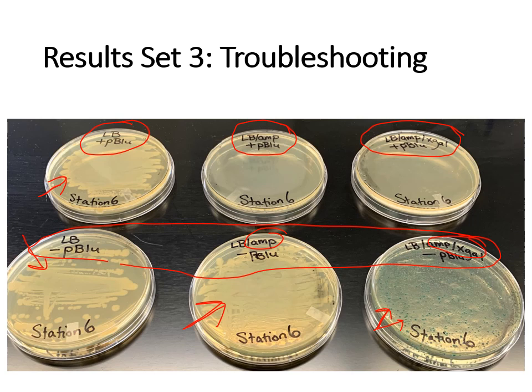The two over here, okay, and I'll even change the color so that you see the ones that I'm putting in green here, that is just condensation. There is no growth here, and there is no growth here.